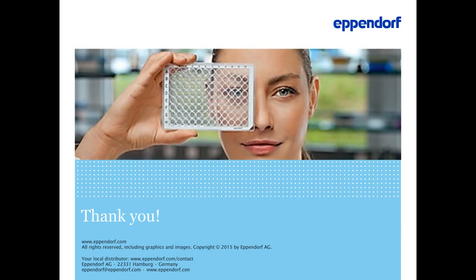Okay. How can you be sure that an experimental result is influenced by consumables or leachables and not by other factors? This is a good question. There can be many things actually. It can be the equipment, the reagents, the PhD student. The best way is, if you have an experiment and you suspect there is something wrong with it, just do the same experiment with different consumables. And one of the consumables should be of good quality, without critical additives. Of course, the best way would be to control with glass, but I'm pretty sure it's not always feasible. Using glass as a negative control in your experiments would be the best option. If not, choose high-quality consumables which are free of critical additives.